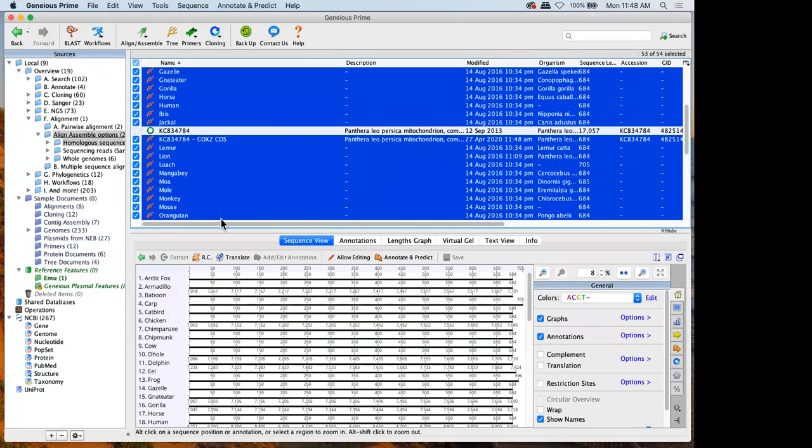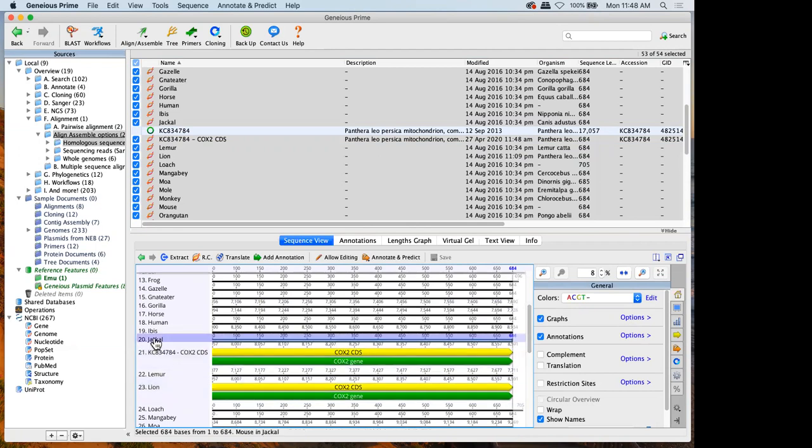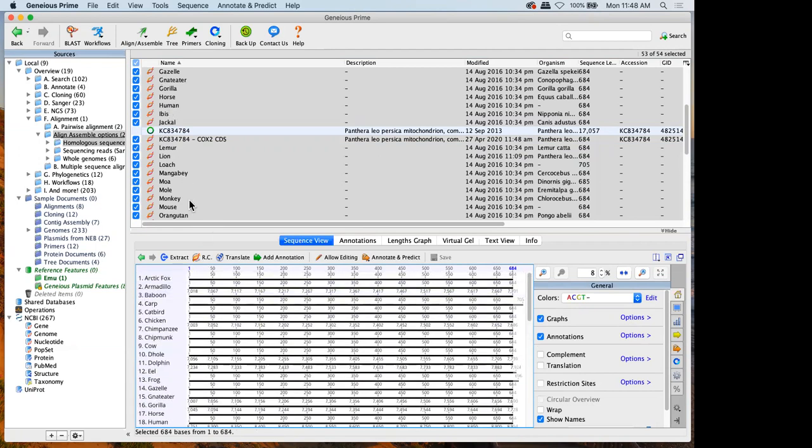So all of these sequences I've got here from the same gene, roughly the same length, they're roughly expected to align against each other. So this sequence is expected to be similar with this sequence, which is similar to this one, which is similar to this one. So if we're talking about this, that's when you would use multiple align. And these could be DNA or protein sequences. So I'm going to come back to this, talk a bit about multiple align in a moment.